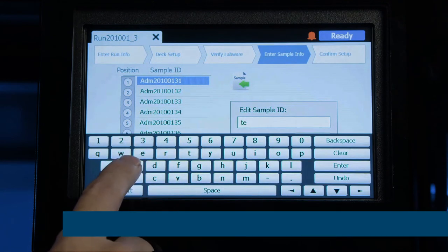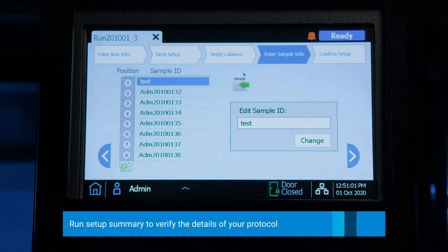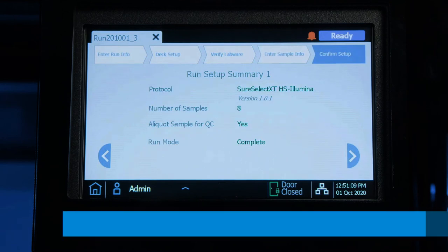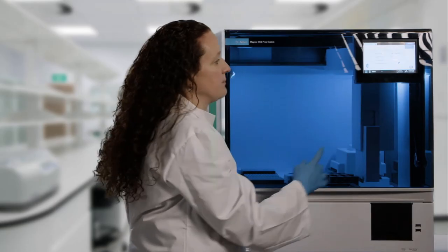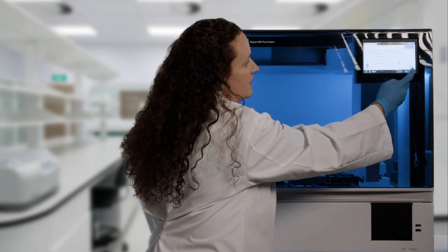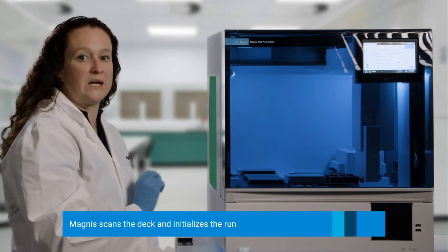After you click through and verify all of the sample information, you get a run setup summary that lists the protocol you're using, the number of samples, whether or not you indicated for an intermediate QC strip to be completed, and the run mode. Continue with the right arrow and verify the correct sample type — today we did high quality DNA with 200 nanograms input. It also gives you the ability to adjust your pre-capture or post-capture PCR cycles by clicking the pencil icon to the right, where you can indicate what number of cycles you'd like. When you're done, push the green arrow to complete the initialization and the Magnis will scan the deck to start the run.